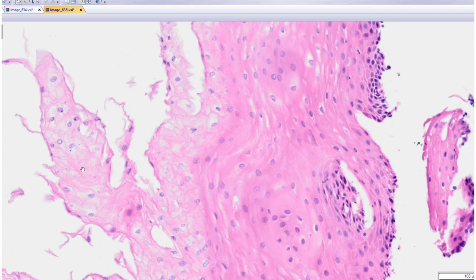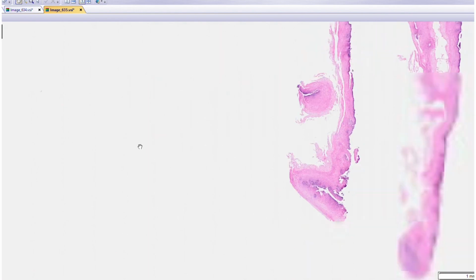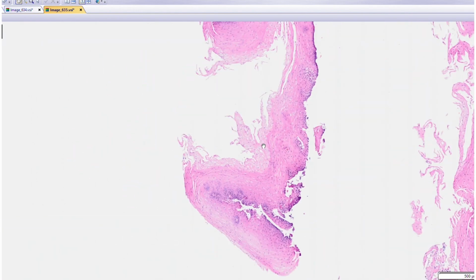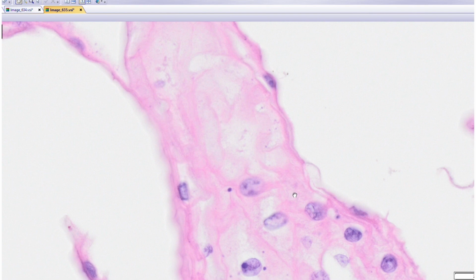You can almost imagine, if you put together a 3D image of it, that the one in the middle here is a really good diagnostic photo for at least some level of family, if not the individual species level.